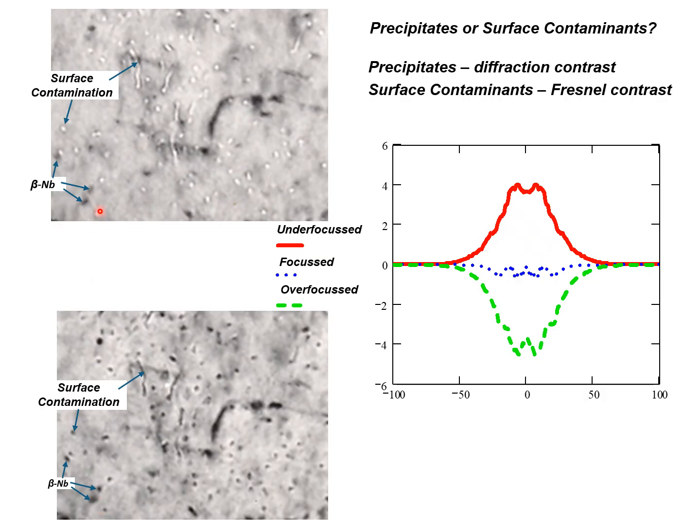So they're both similar contrast, even though different degrees of fuzziness. That tells me that these are real. It's a lot more difficult analyzing and proving that they're niobium rich, but I have done that. These are actually beta niobium, roughly 85% niobium.